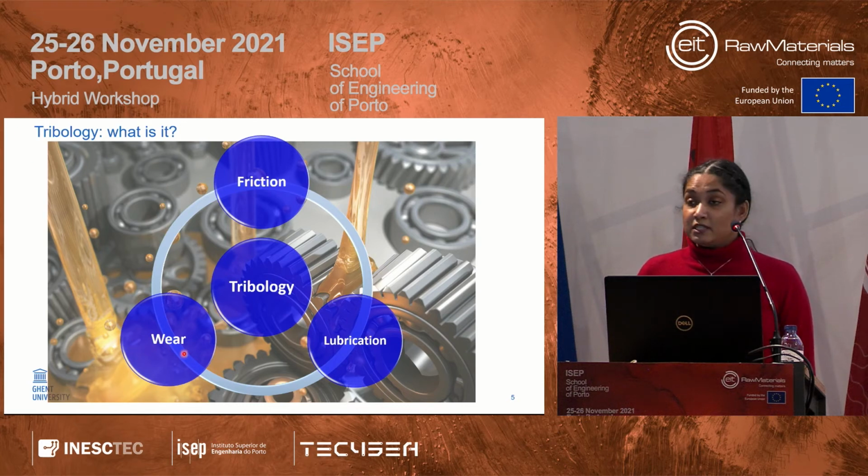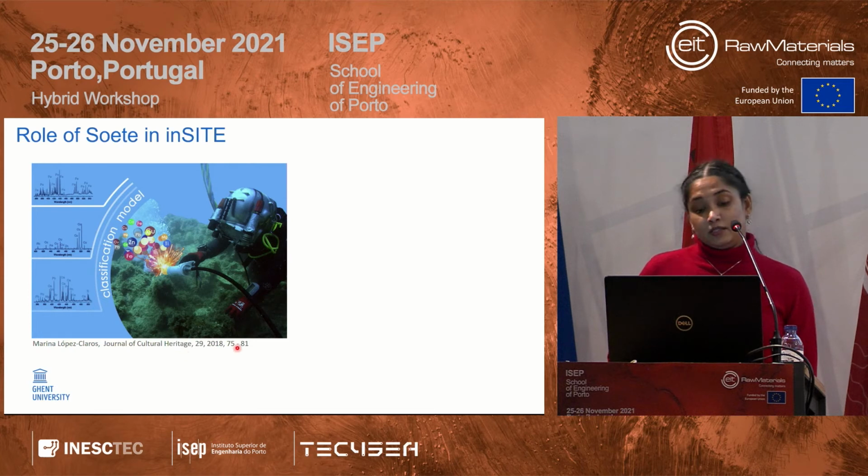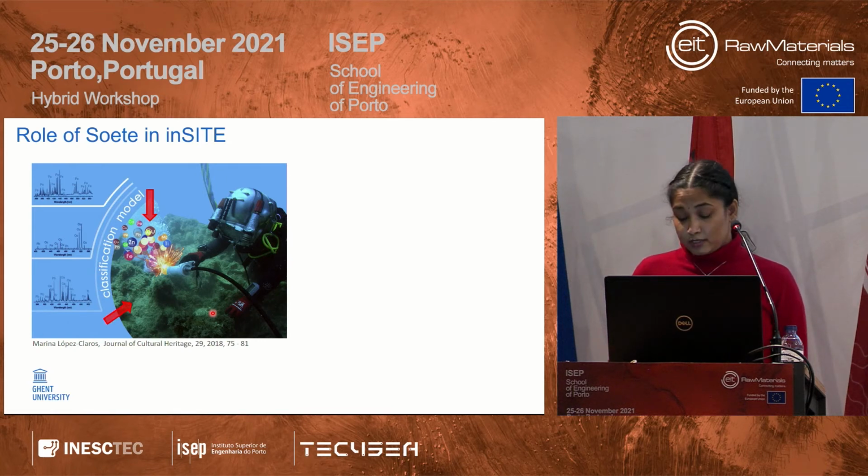So from these fields of tribology, how are we involved in this project of inSITE? We have already heard a lot about the plasma, the ions, the quantification, and the minerals, the geological part of this project. But right now, we are going to deal with a very small, minute part, the casing of this LIBS.